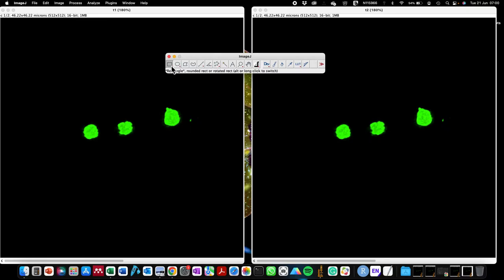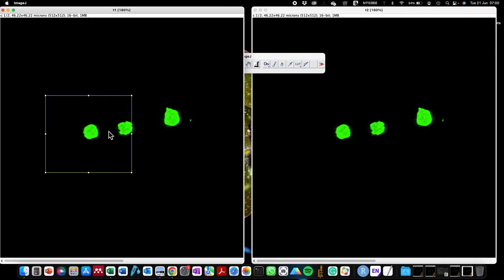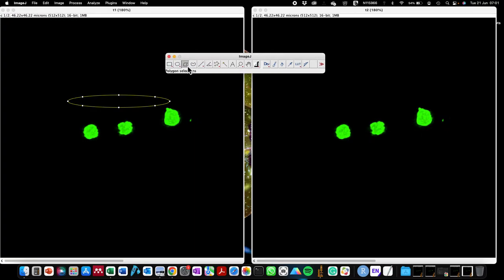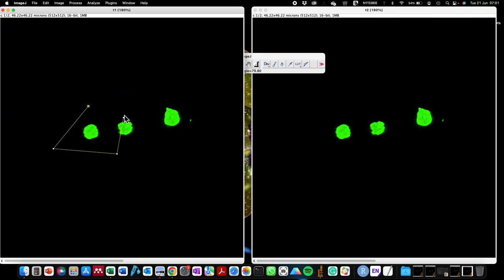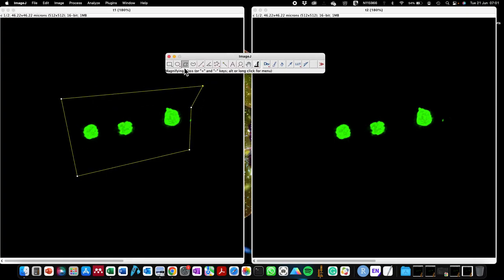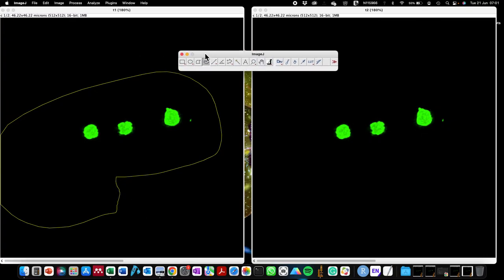On the left-hand side of the ImageJ window, or Fiji window — because these two are the same, just that Fiji is more advanced than ImageJ — you have the different selection tools. The first draws a square, the second is an oval or circular selection tool, the third is a polygon selection tool that you can draw at specific coordinates, and the last one is a freehand selection tool where you can quickly draw around the region you are interested in.